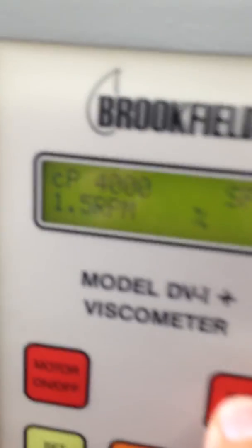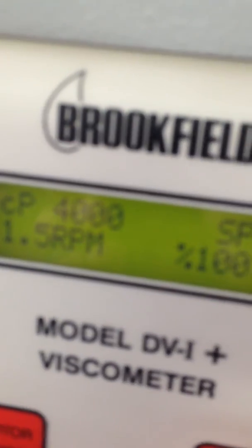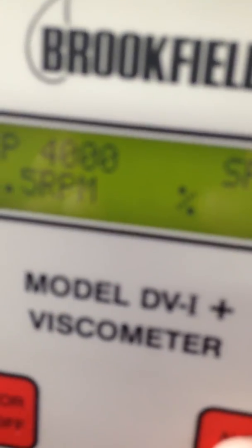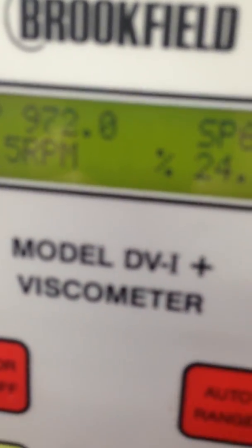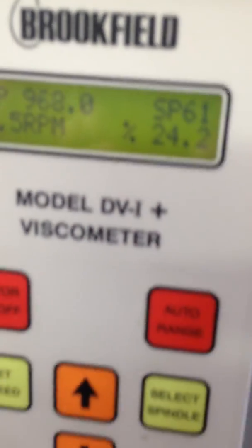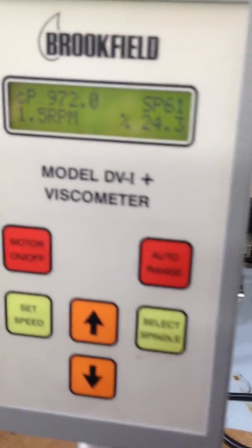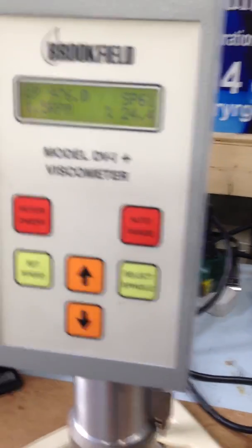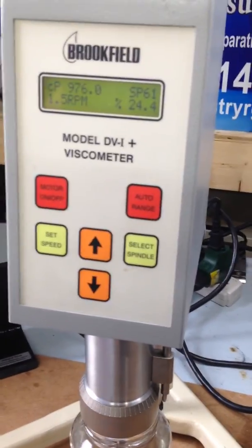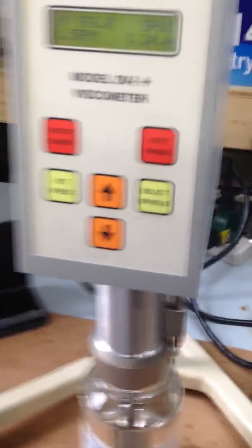You say auto zero, you hold it and it says four thousand. That means that you're good up to four thousand with this viscometer. That's it, thank you very much.